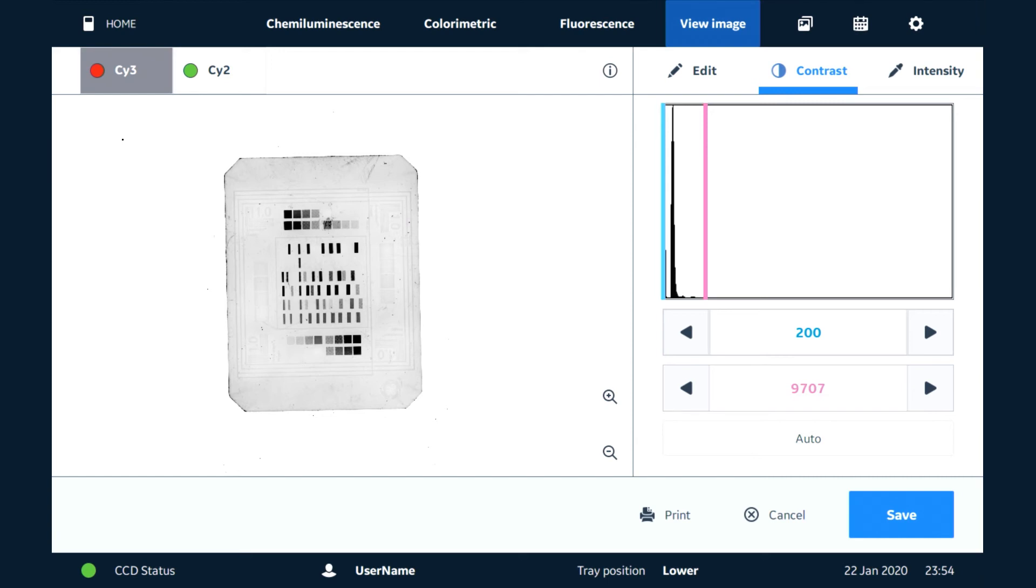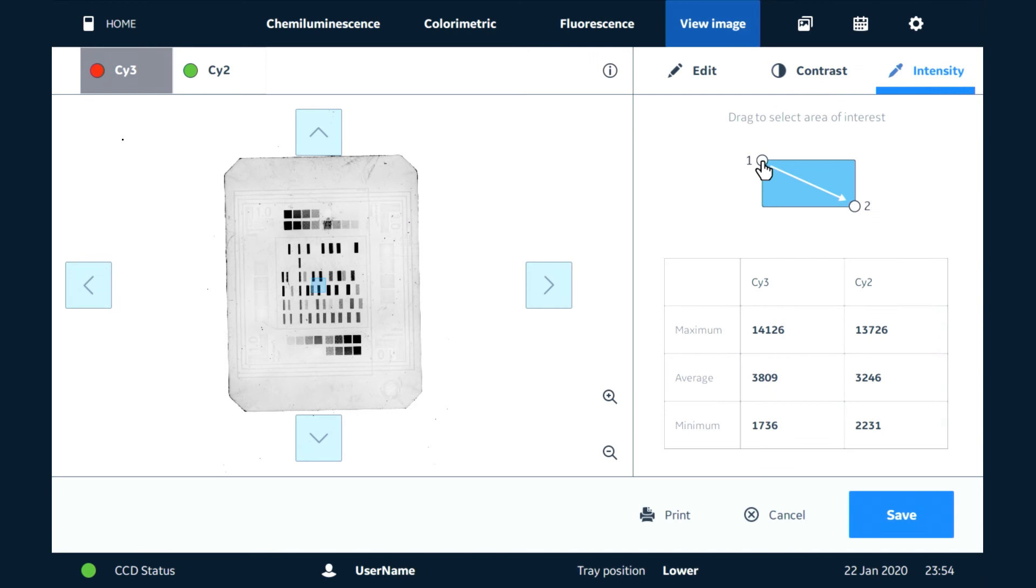We can also go to the intensity tool. When you use that, you have the ability to slide over a particular region of the image, and then we can check the intensity levels. So here we can see for the Cy3 channel, we had a maximum of 23,477 counts.